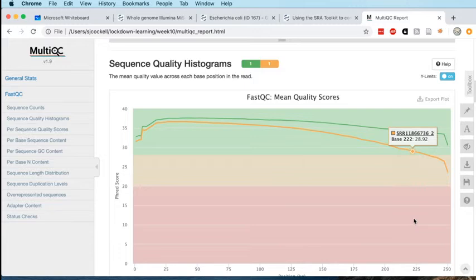So can you rescue that experiment by performing quality trimming? Well, you can certainly help it out. You can get rid of those poor quality base calls, those base calls that are more likely to be wrong, and therefore that will help your mapping. Your mapping is more likely to be accurate, and the bases which map are more likely to be correct.